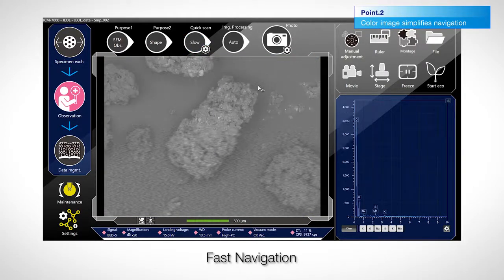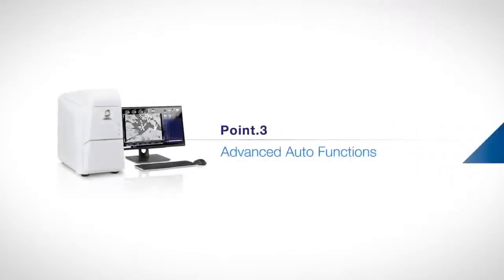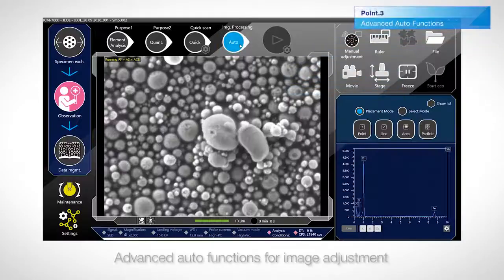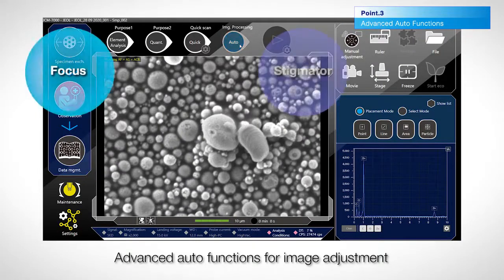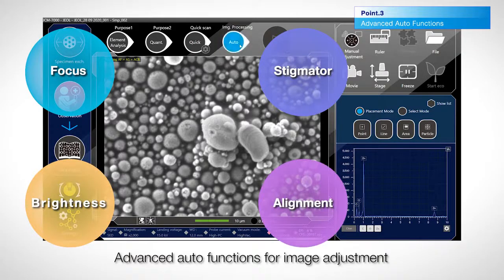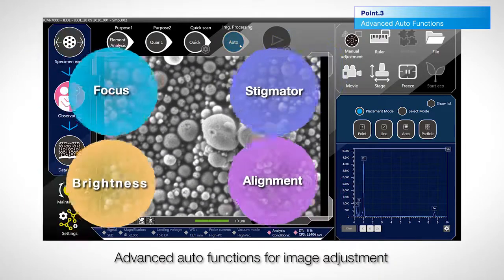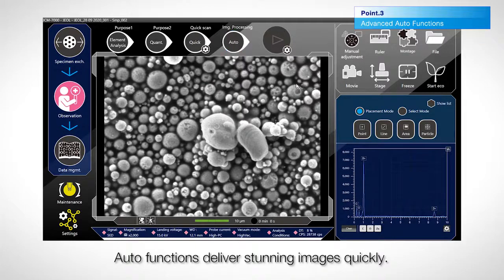The JCM-7000 includes advanced auto functions for fast optimization of the SEM image. Auto functions include focus, stigmator, brightness, and alignment. Operators at any experience level will appreciate how quickly images can be acquired with these auto functions.